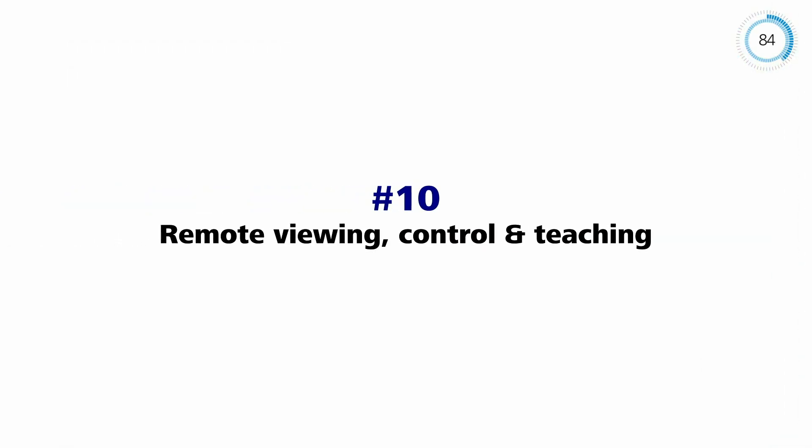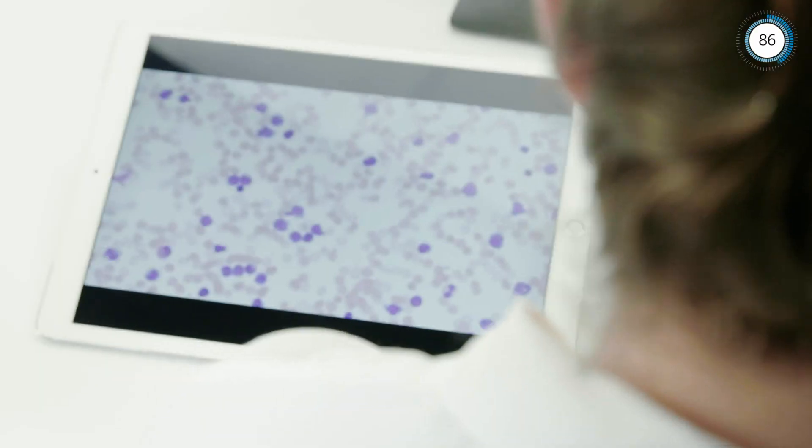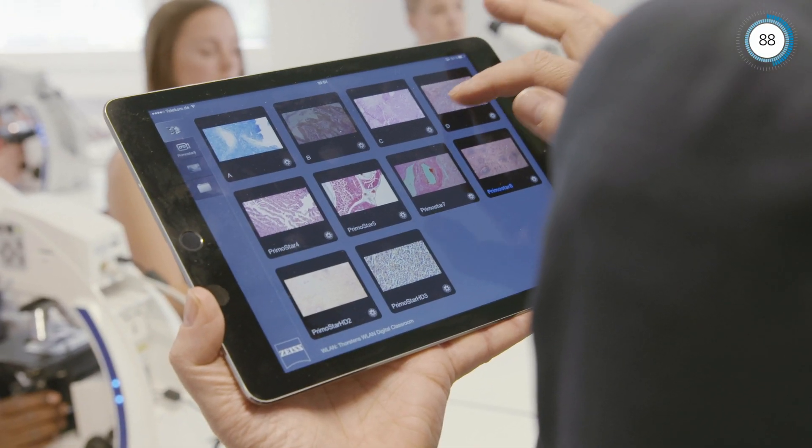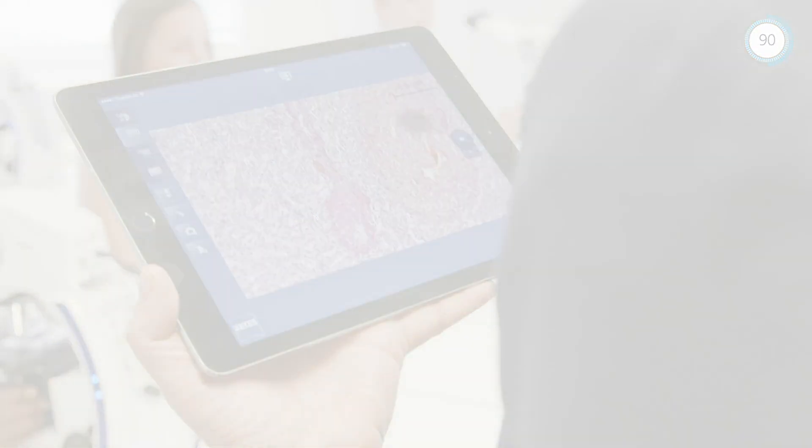These smart microscopes can be interconnected, making it easy to share images with each other. For further information, visit our website.